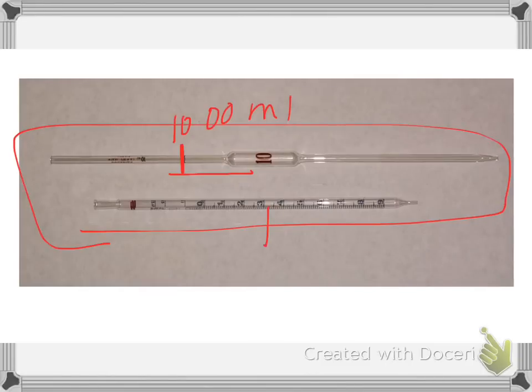This top one has only one line on it and the line is a 10.00 milliliter line. Now, this pipette has a bunch of gradations, so I can use it when I'm measuring out 1, 2, 3, 4, up to 10 milliliters.